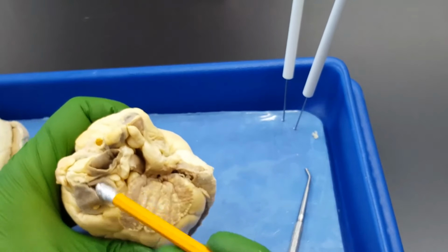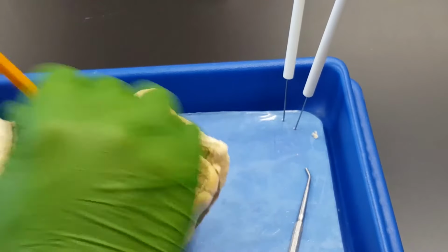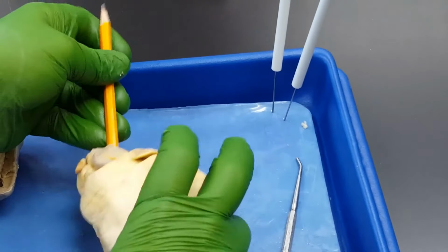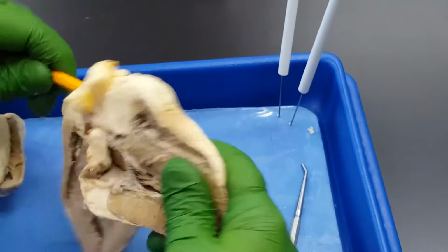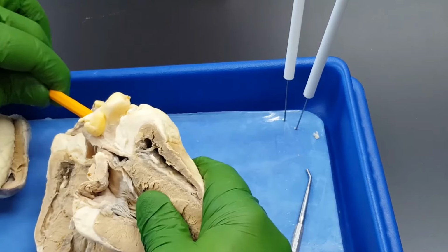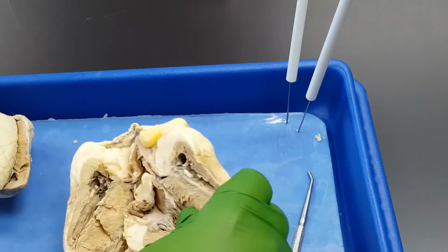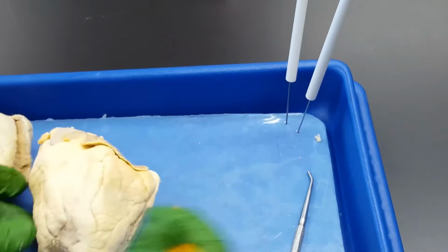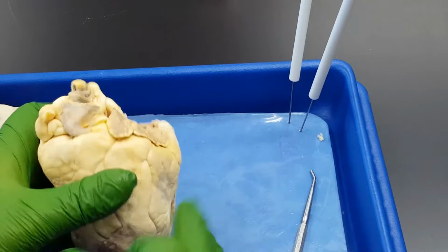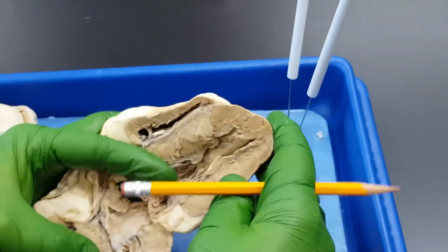In this same heart, if I go back into the pulmonary trunk, right here, everybody, notice I'm directed to the right. This is just the way the pencil actually goes. His right, not your right. So I come out in that right ventricle. The pulmonary semilunar valve is back here at the top of the right ventricle. Usually not well seen in a dissection. In fact, you don't see that many people asking pulmonary semilunar valve because it's so difficult to see in this dissection. But the other three are pretty obvious.